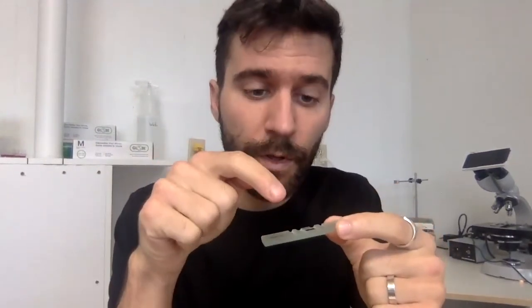Now I'm going to take a very small sample from the final dilution and add it to this plate. This plate is calibrated such that there's a known volume on here, and any excess volume falls off the side. So there's a known volume on here, and that's useful to know for our later calculation.